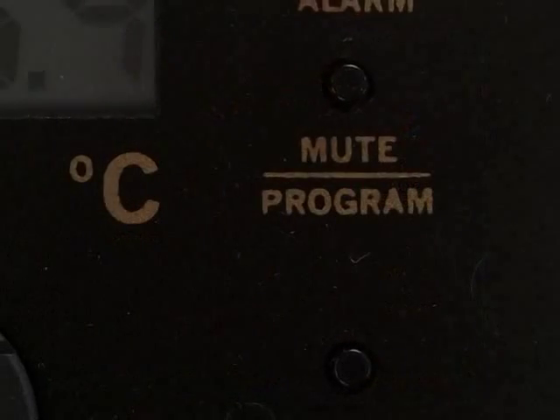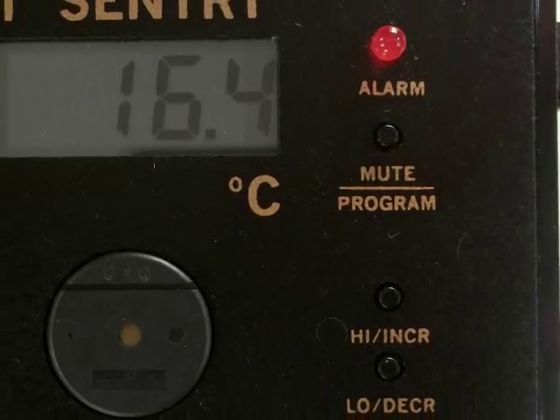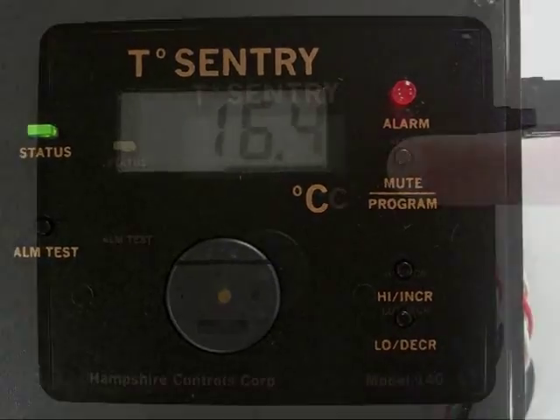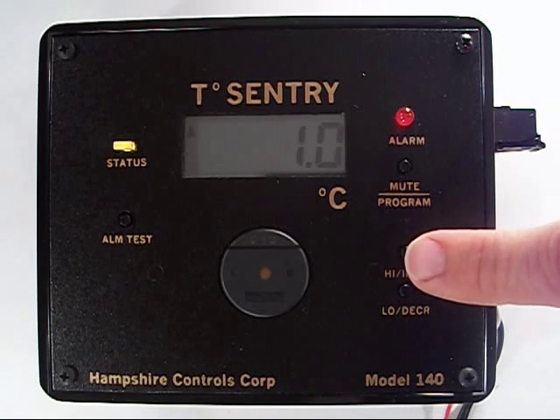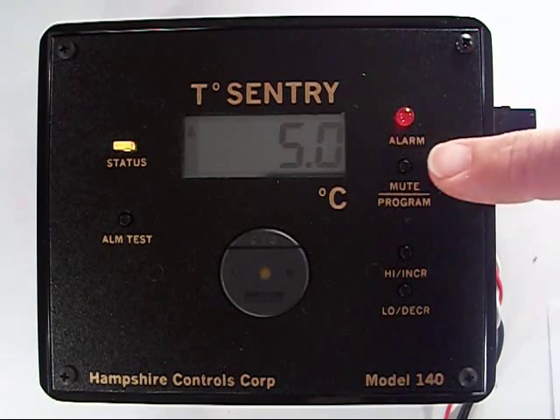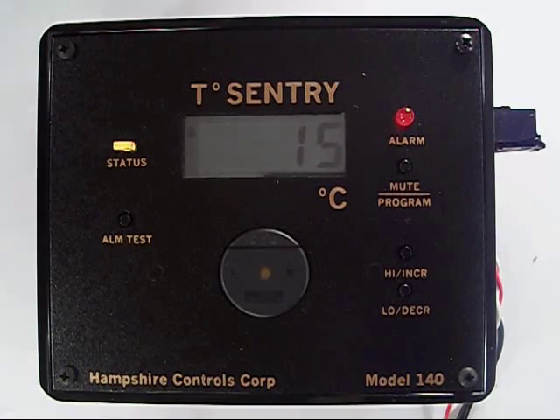Don't walk away yet. Hit the program button and check the commands you just did to make sure they're what you want. I wanted: high temperature limit 5 degrees, low temperature limit 1 degree, alarm delay 5 minutes, relay delay option 10 minutes, alarm silence mute 15 minutes. I'm all set.